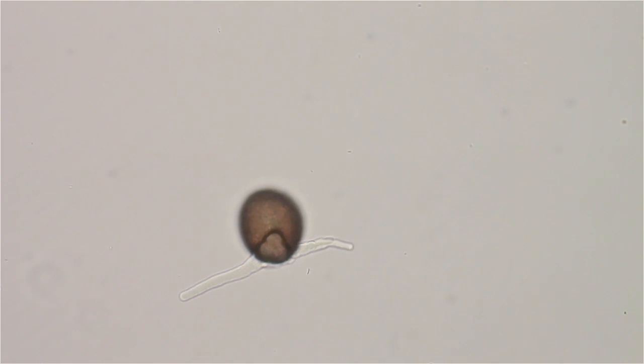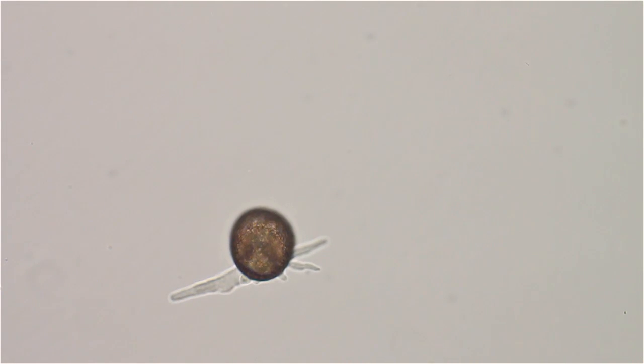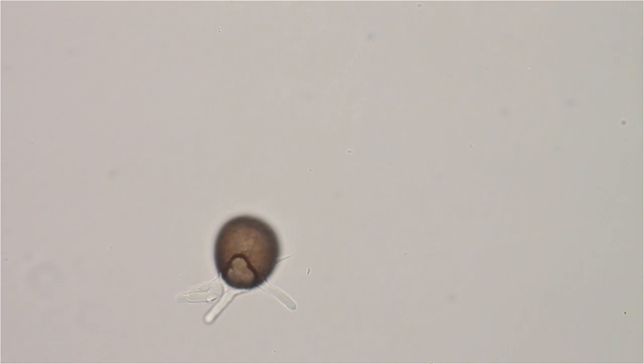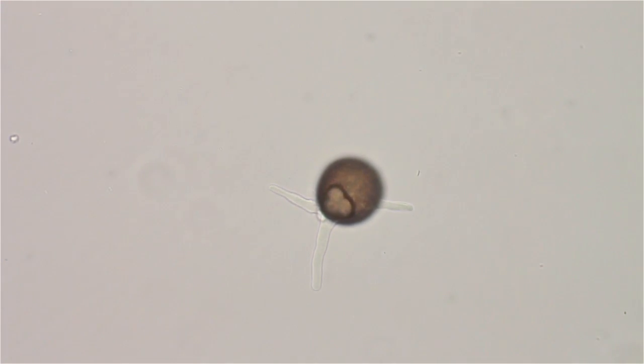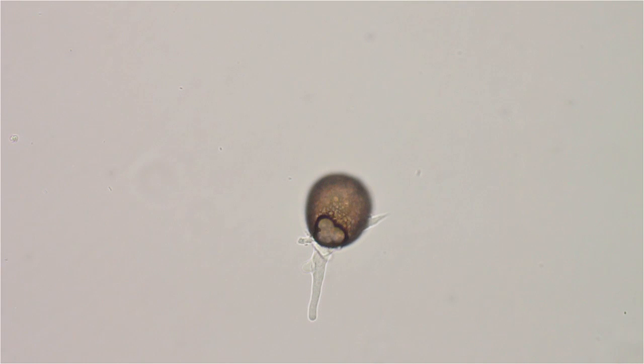Here we have another Difflugia, with a motorcycle going by on the road outside. This one is a little bit different from the one yesterday. Can you tell the difference? The one yesterday had a four-leaf clover opening on the bottom or top, and this one's only got a three-leaf clover. How about that?